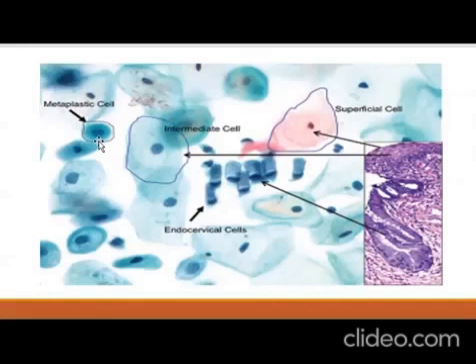So, also I would like to tell you, as early as now, hindi lang po kayo magbabase sa color ng cell when you try to identify the cells in the smear. Okay? Once you discuss this in the lecture, you will see na aside from the color, you also need to take note of, for example, the size and the shape of the cell.